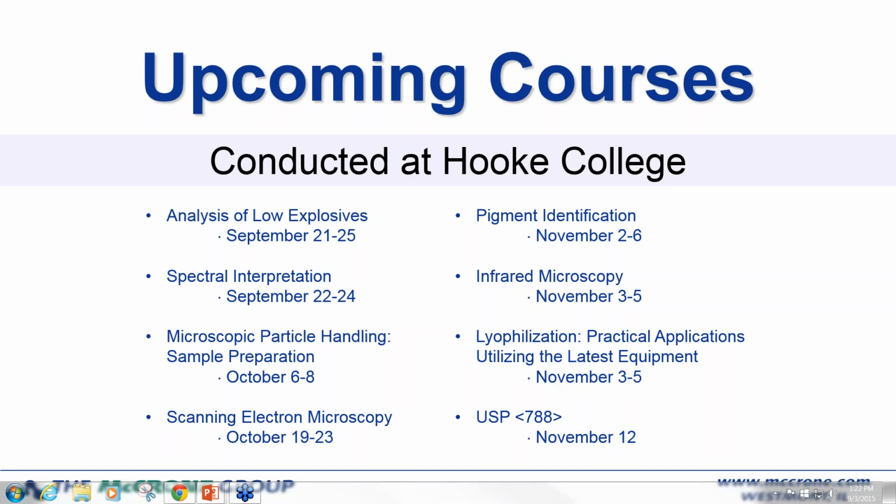Okay, great. We have one from Jan. I always start with micro Raman. Is micro IR your starting technique?